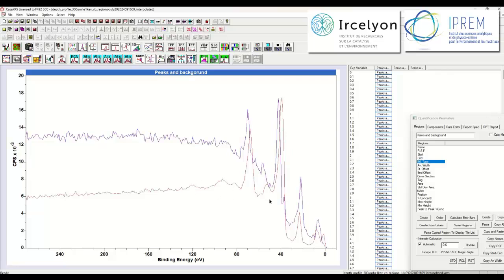And you can see that the intensity of these photoemission peaks relative to the lift in the background is very different. So one is characteristic of a material that has a buried layer that is generating background signal due to inelastic scattering, and the second one suggests that it is a layer that is closer to the surface, and the inelastic scattering is only due to electrons passing through the material that is being represented by these photoemission peaks.